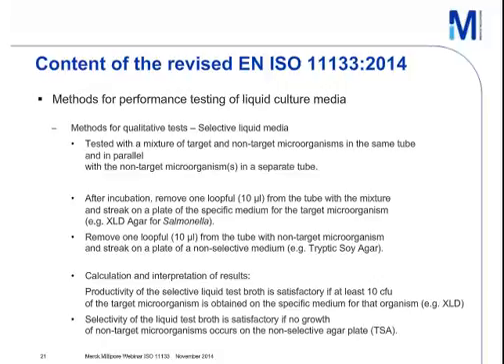The reason behind this is that with the mixed culture, the real situation in a food, for example, where not only the target microorganism is present, should be quality controlled and streaked on the specific medium. But on the other hand, the selectivity has to be tested and streaked on a non-selective medium to see the amount of inhibition. After incubation of the solid media, the results are calculated and interpreted.